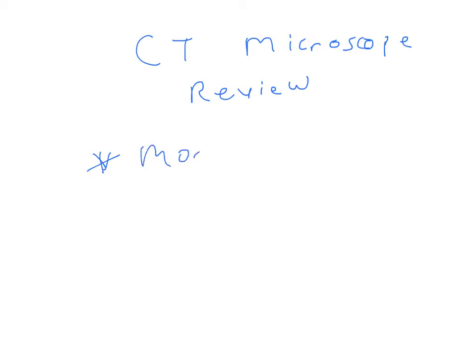Here is your connective tissue microscope slide review for the first quarterly. Most importantly, again, I would encourage you to visit Moodle and to look at the posted images that you and your peers posted. Again, this is what you will see on the quarterly.